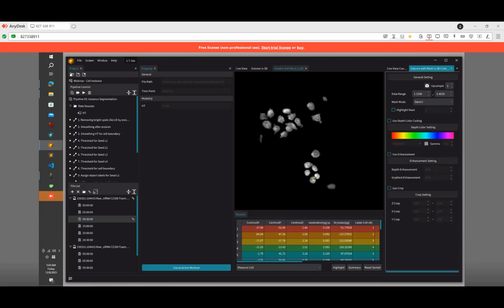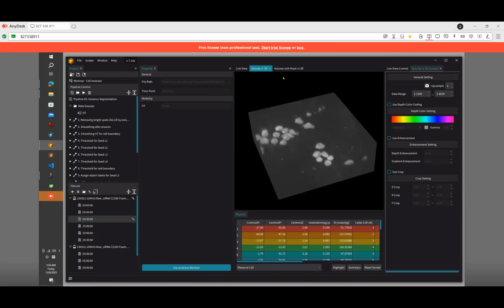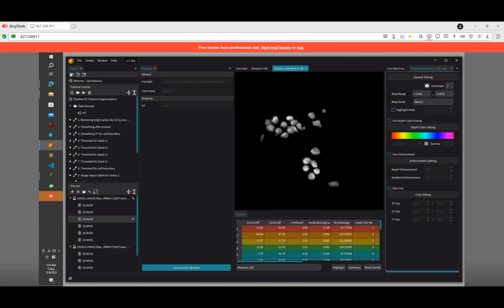In this case, because of the segmentation, it's clearer than the previous one. With this, you can have a nicer identification of the cells in 3D using the information acquired during the analysis. You can use this without any analysis, and if you have some analysis result, then you can do this kind of visualization to have a clearer representation of your data.